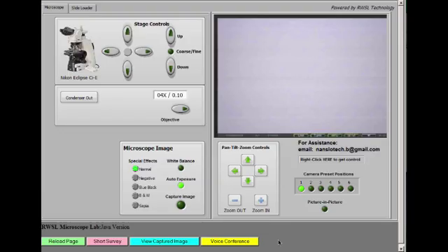This window may open behind another one, so you might have to look for it. But this is the control panel for the microscope.